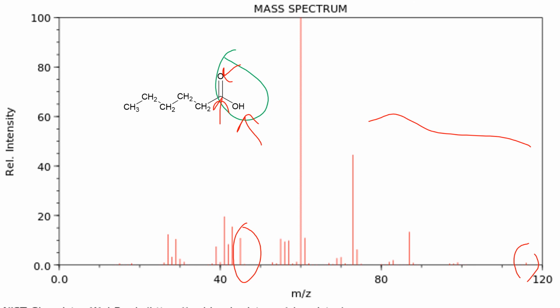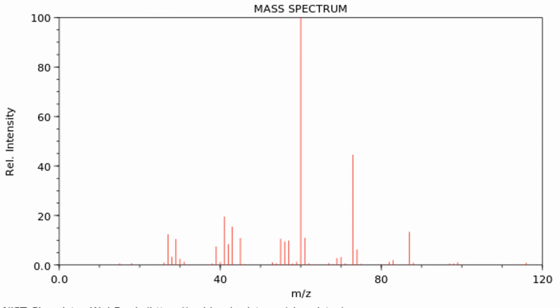So once we identify the different fragments of the molecule in this graph, we end up with a molecule which in this case is hexanoic acid. And we know that from, on this graph, the location of the molecular ion peak, which would be somewhere around here, and the presence of ions at several likely peaks.